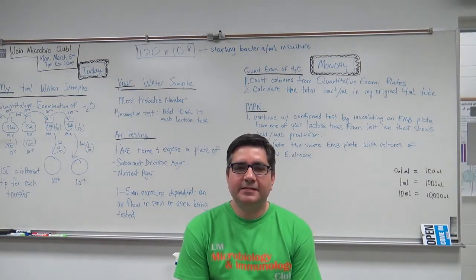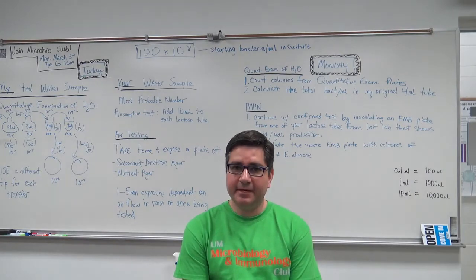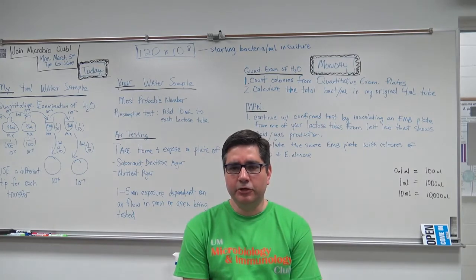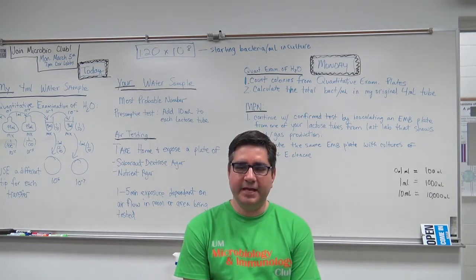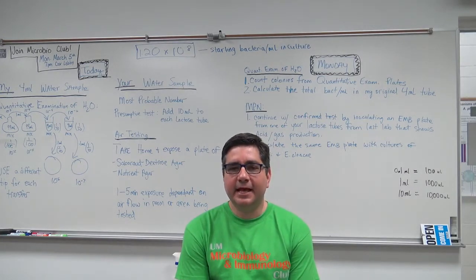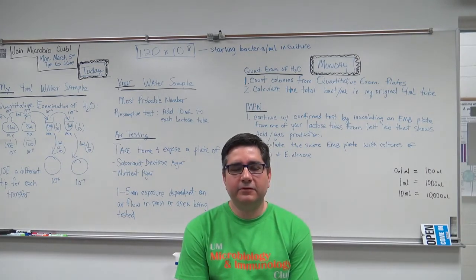The presumptive test is called this due to the fact that we are simply inoculating the water sample in a lactose tube and examining it for the presence or absence of acid and gas production due to the lactose medium's fermentation. If a tube at this stage in the procedure has acid and gas after inoculation and incubation, we cannot conclude that this is solely due to the presence of E. coli, as E. aerogenes, which is commonly found in the soil, could also be causing this to be formed.